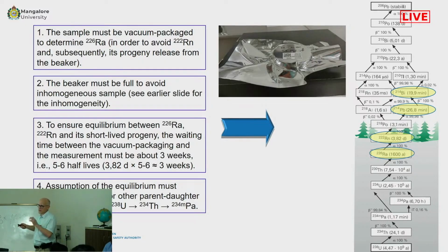But this is quite a difficult thing in some cases, because, for example, some biological vegetables may absorb, I don't know the correct term, but I call this absorption. They absorb thorium very much, which means that there is an excess of thorium in relation to uranium.